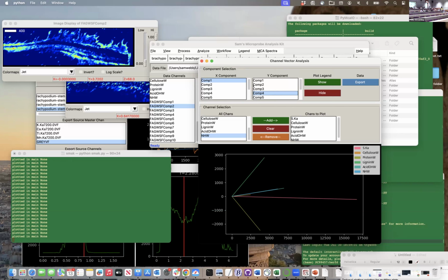It's a great point. I think we really need to think a little bit more about how internally we can make sure, before we go into the measurements, that we could use other microscopy within the system that just keeps us on the same road. Yeah, that's a great point.